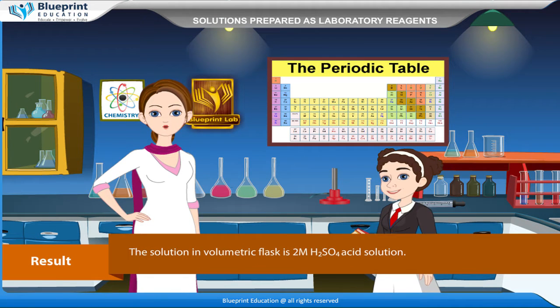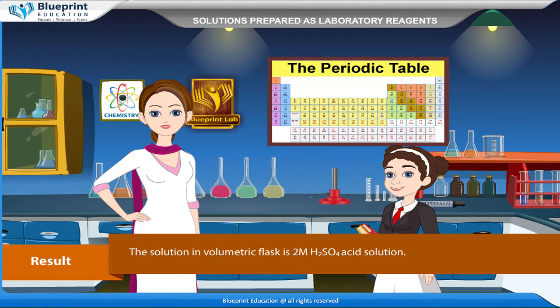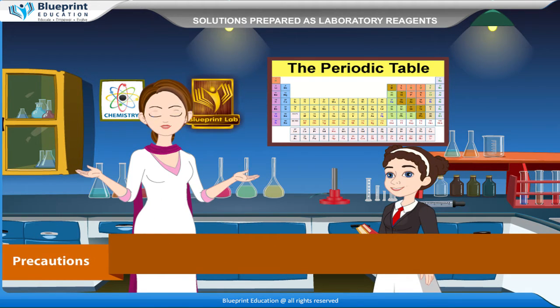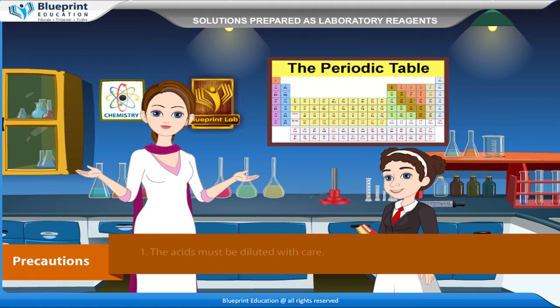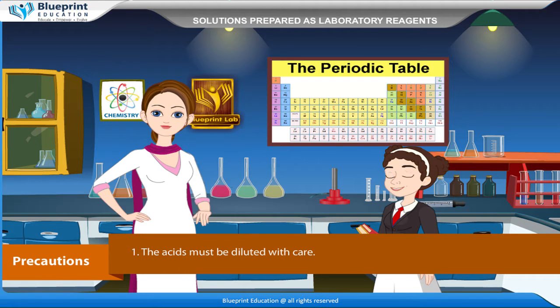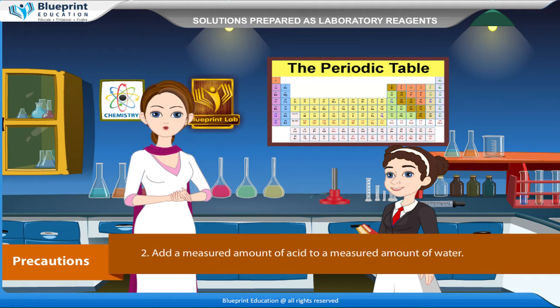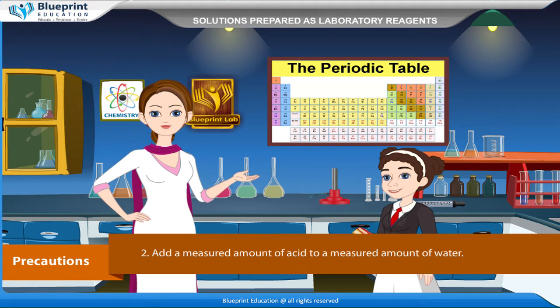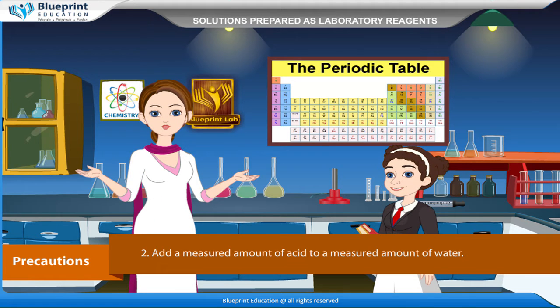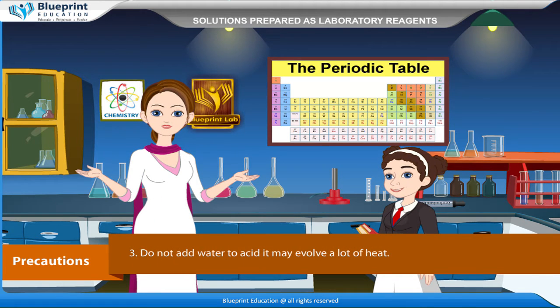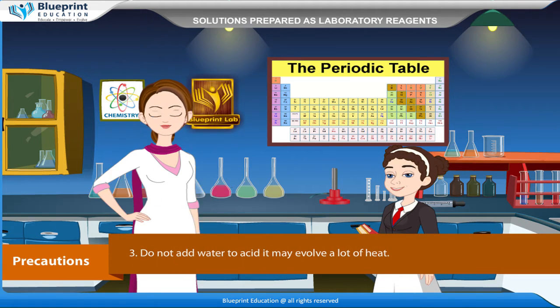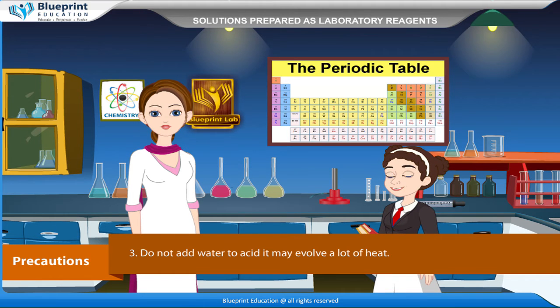Result: The solution in the volumetric flask is 2M H2SO4 acid solution. Precautions: The acids must be diluted with care. Add a measured amount of acid to a measured amount of water. Do not add water to acid, as it may evolve a lot of heat.